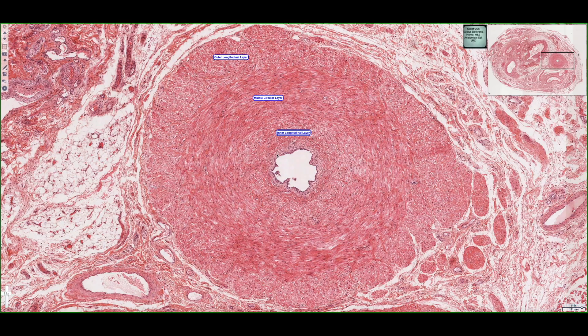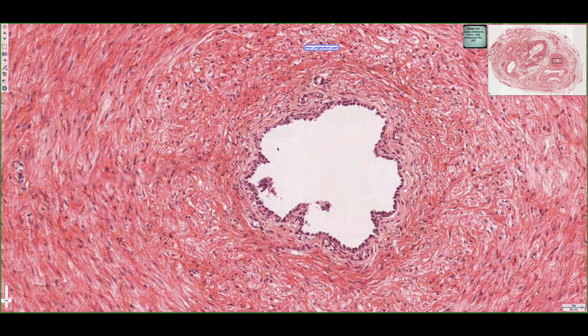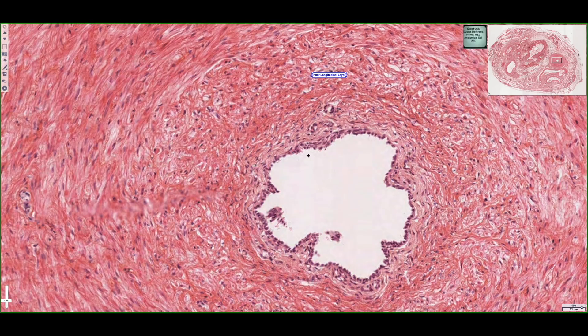If we look closer at the inner longitudinal layer, we can see that the muscle fibers sort of end around this region, and then we have a lighter region. Zooming in, the fibers transition from this smooth muscle layer to a loose connective tissue known as the lamina propria, which surrounds the entire duct portion of the ductus deferens and supports the epithelial tissue that lines the duct.